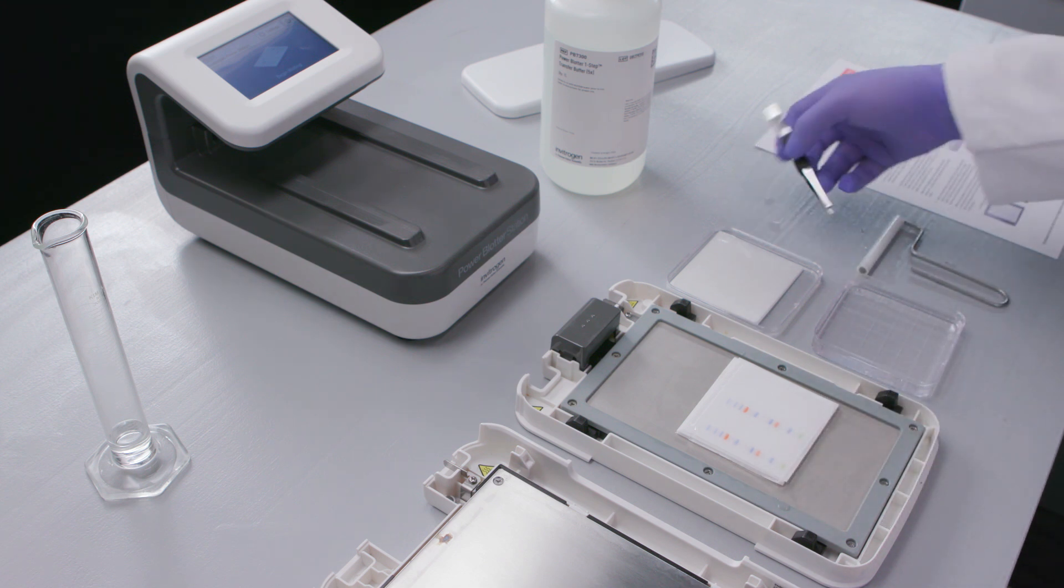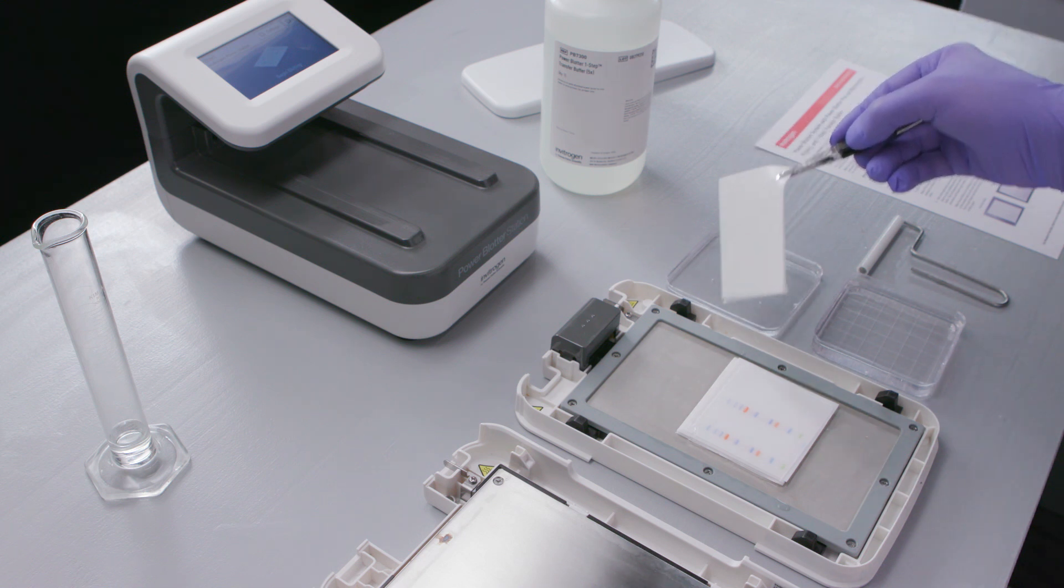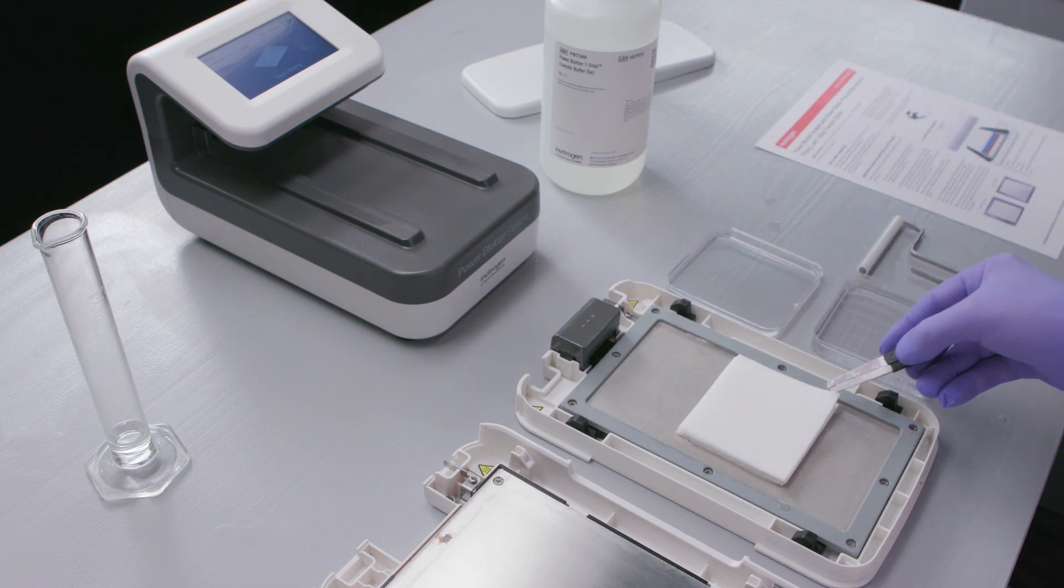Place the other two pre-wetted filter papers on top of the pre-run gel and use the blotting roller to remove any air bubbles from between the gel and the filter papers.